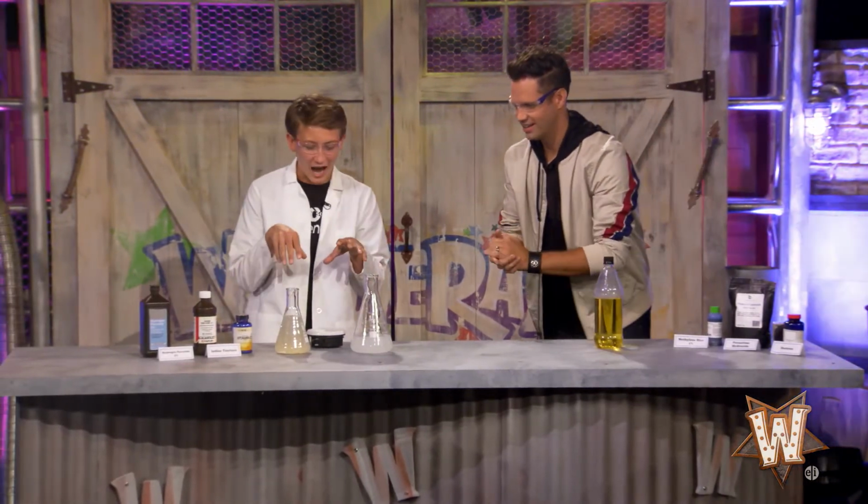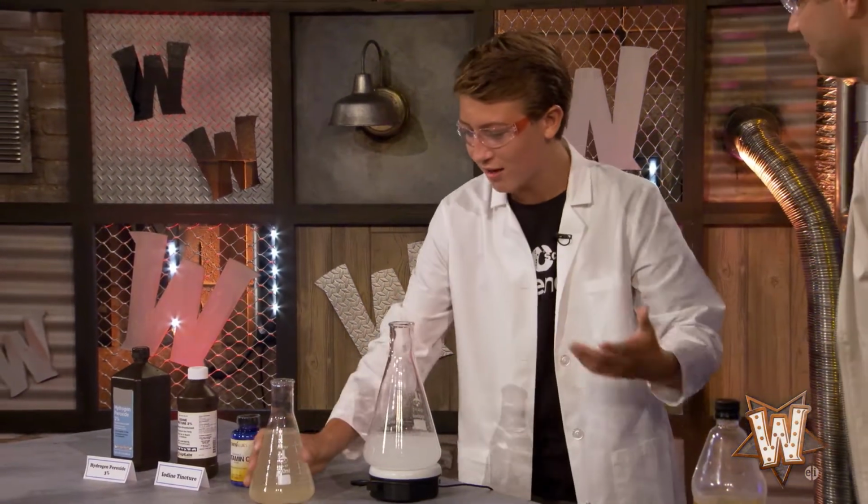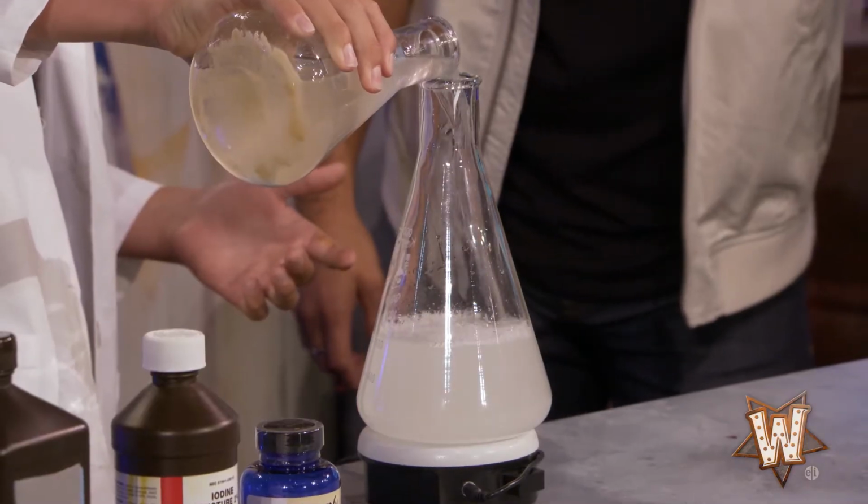Okay, all right. So, first thing we're doing right here, it's known as a clock reaction. So we have a clock reaction, because it changes color at a certain time. We're going to mix these two liquids, and I'll tell you what's in it in a second.